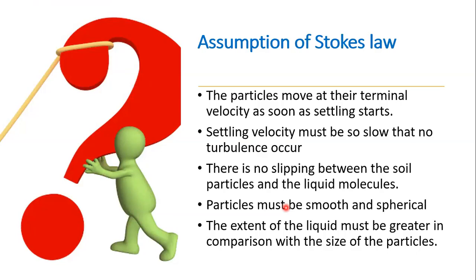Because we have to follow Stokes' law to analyze the soil texture, for that we have to make some assumptions. The particles move at their terminal velocity as soon as settling starts. Because when we put the soil in the water and we start the stopwatch, it means that from the start the speed is the maximum. So generally it does not happen.